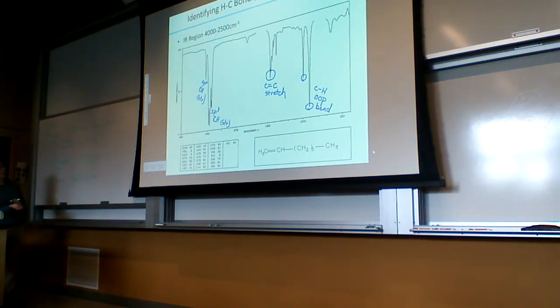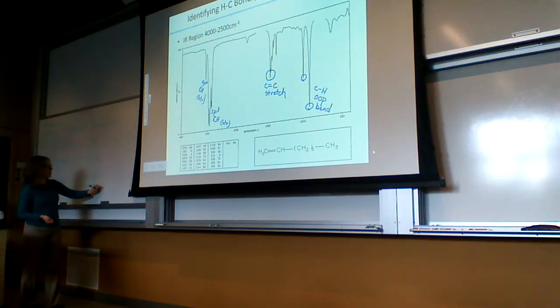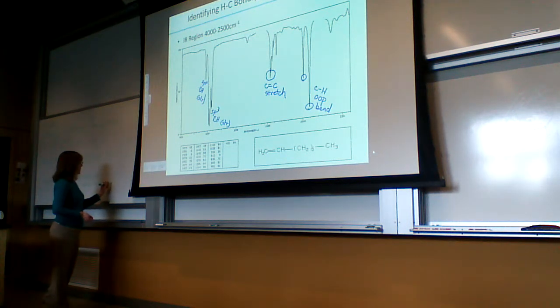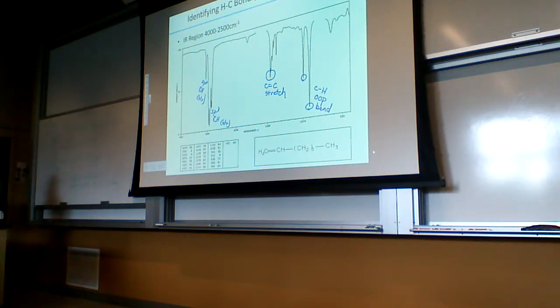Alkyl groups on that: if you put more methyl groups on there, it's going to increase the wave numbers but decrease the intensity. So as you look at a more substituted double bond, we've seen this, the intensity of it goes down because it's more symmetrical and the dipole moment's not quite as strong and you don't see it as well, but it does increase the frequency a little bit.